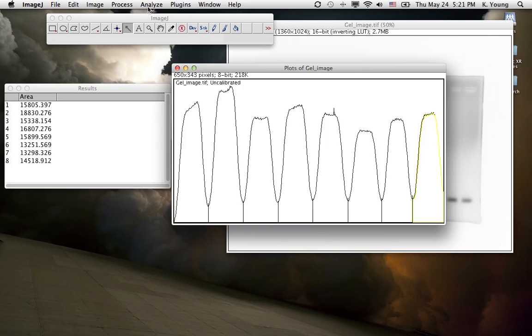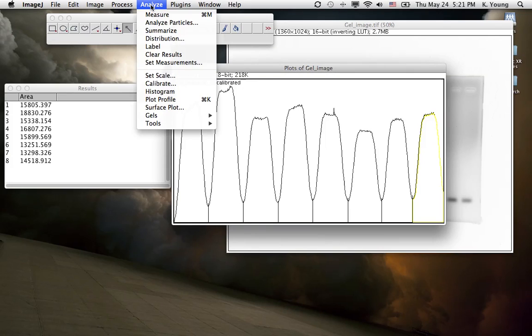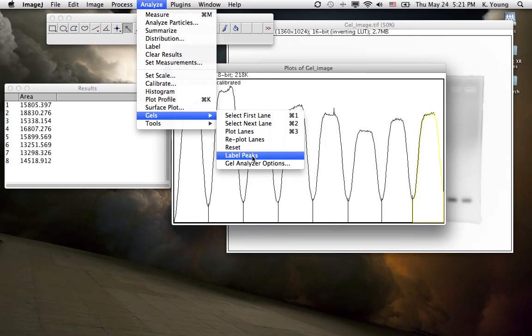Next thing we want to do is go to Analyze, Gels, and then label the peaks.